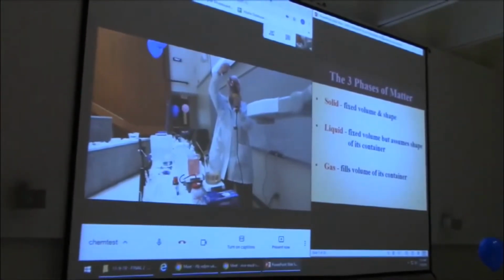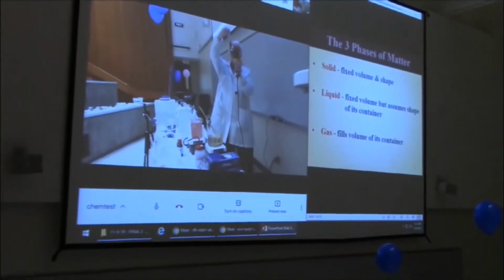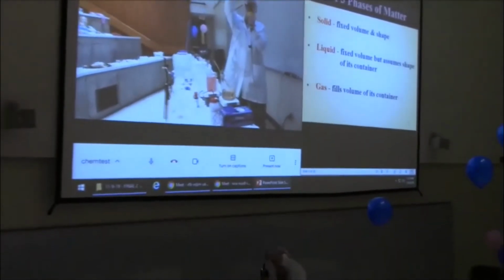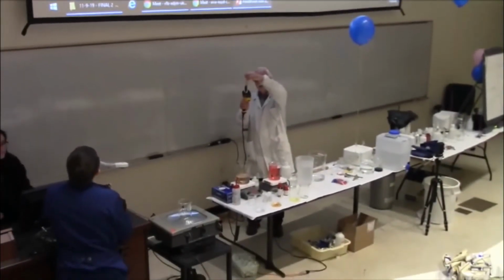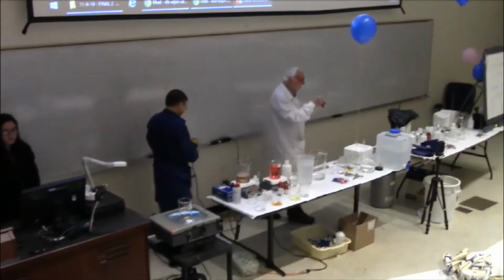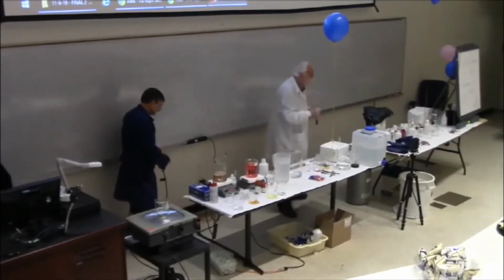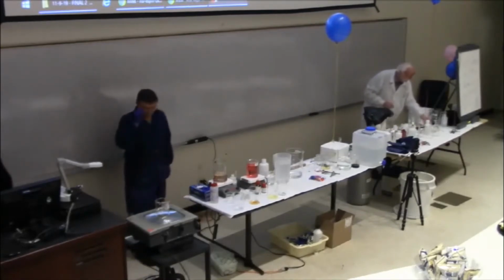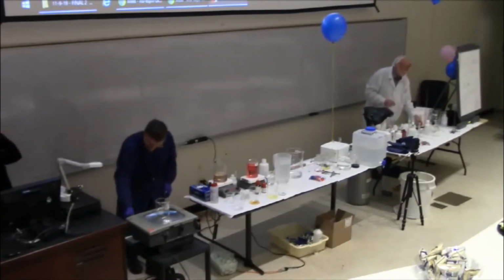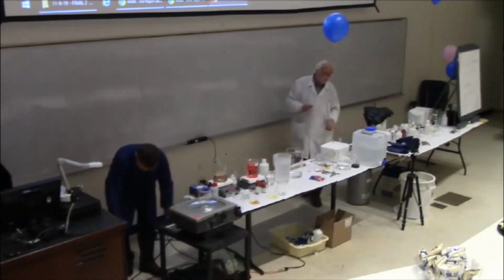We're going to see another material that has the property of sublimation in a minute. This is still hot, but after the show, if you want to come up, you'll see that some of the crystals have actually sublimed up and they're sticking to the wall. Now I said there's another material that has the property of sublimation. Can anybody guess what it is? I'll show it to you and see if you know what it is.